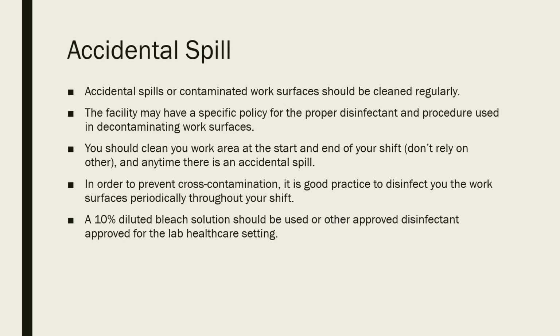A good example of making sure you decontaminate your work surfaces is your microbiology department. You are dealing with potential biohazardous things that could cause an infection.